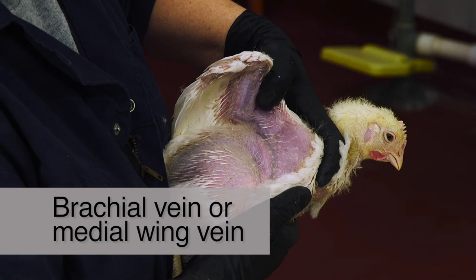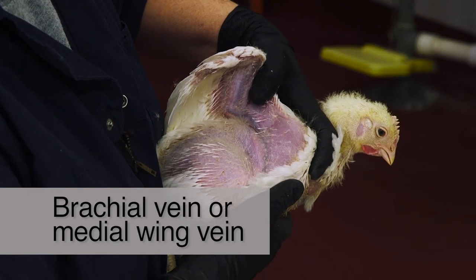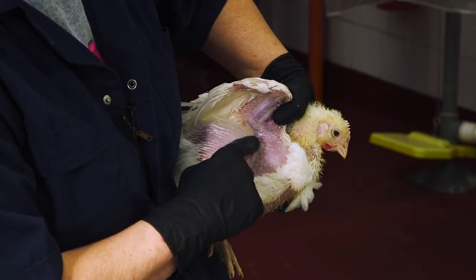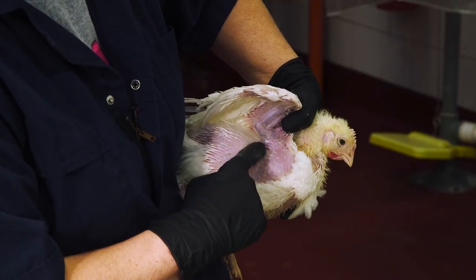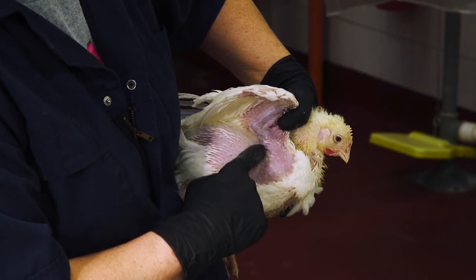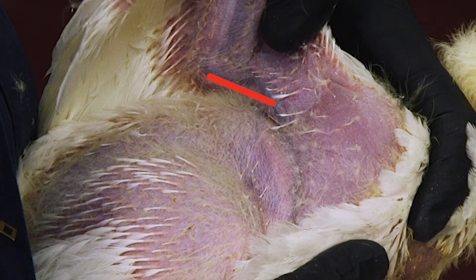Next, let's look at the anatomy of a bird's wing and see where you'll draw the blood sample. The brachial vein, frequently called the medial wing vein, is the most common site for collecting blood from birds. This vein is located on the underside of the wing, between the biceps and triceps muscle, running parallel with the humerus, the arm bone. It is a large vein immediately visible under the skin, as the skin is extremely thin and nearly transparent in this area, with few feathers covering the vein.